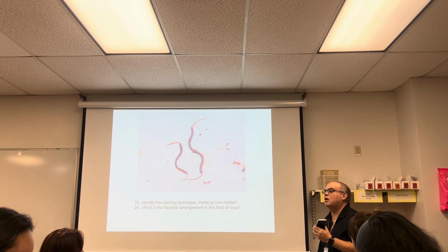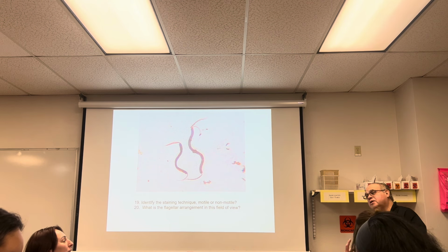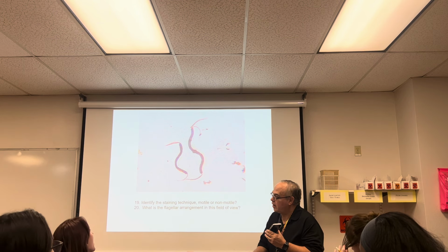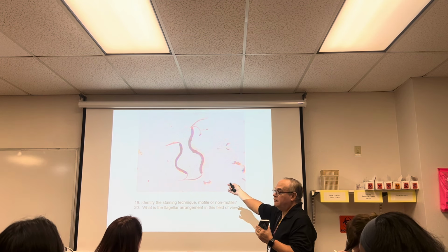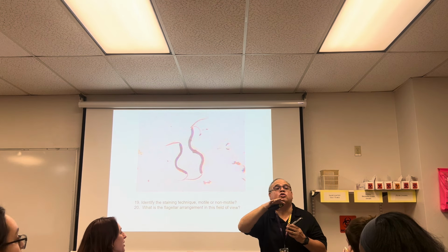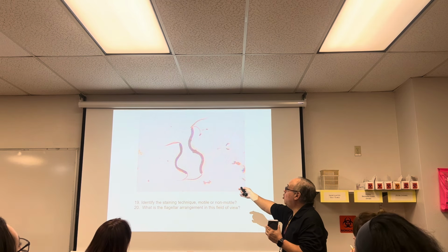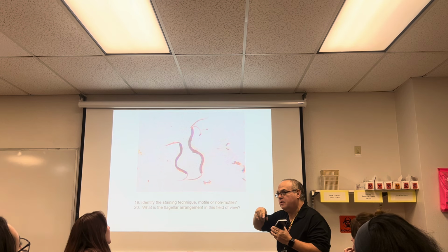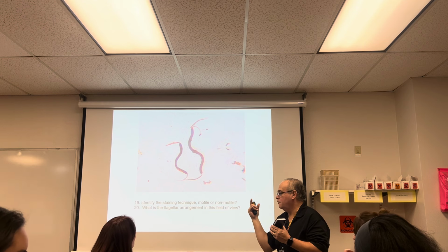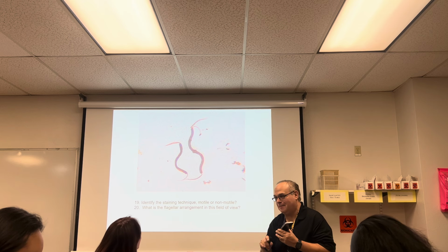What's the flagellar arrangement? You fell into my trap. Why? Because this one's showing a tuft. You're looking at a three-dimensional organism in one plane. So if you see more than one here, they're in a tuft. That immediately moves them into a different arrangement. What are they? Lophotrichous. Be sure you understand what I'm asking.